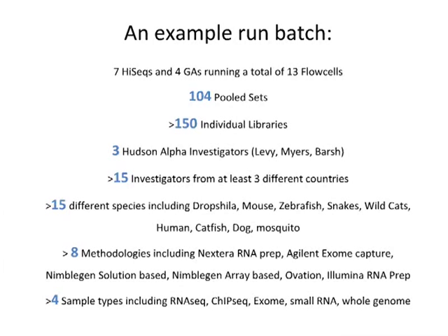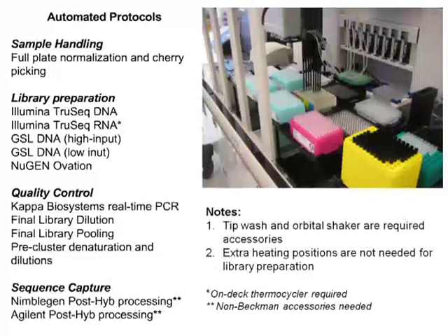Some of these library preparation procedures were automated and some were not, but all of the quality control, all of the dilutions, and finally the use of Kapa Biosystems real-time PCR assay for quantitation of library, all of those steps were done using automated solutions to generate the final material that went onto the flow cells and through clustering.